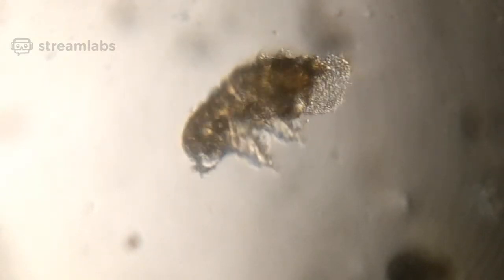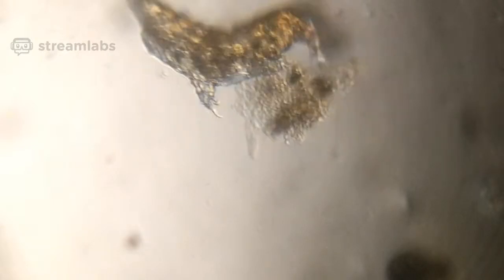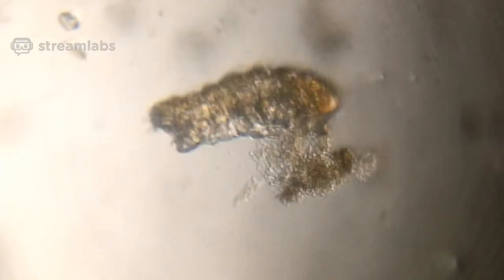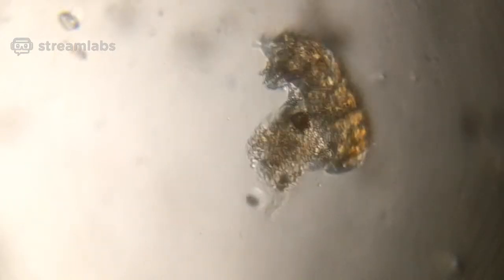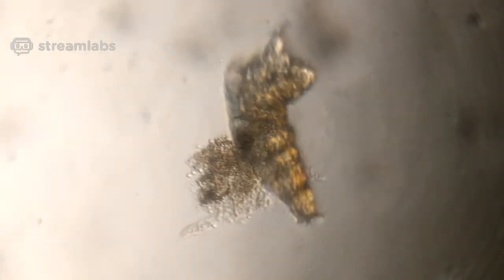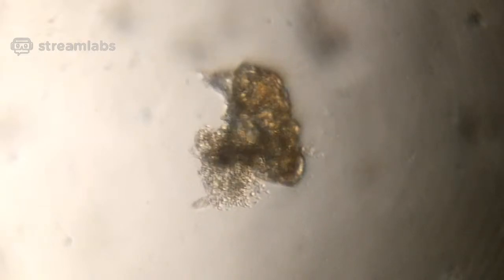This one grows in lichens. Normally, if you want to get a tardigrade, for every 5 lichen samples, you're likely to get a couple of tardigrades. That's how it is. I just have to go out. I don't have to walk very far from my place, and I usually find them in lichens, and I keep the lichen aside like I just did, in case I'm bored and I want to look at them again.